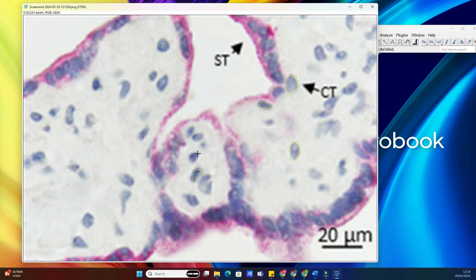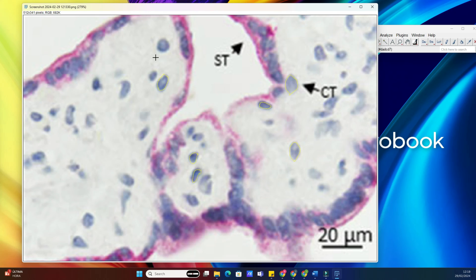Now here's where the magic happens. Hold down the Shift key on your keyboard and draw another polygon around the next cell. Notice how each polygon we draw is added to our selection. We can continue this process for as many nuclei as we need. And there you have it — we've successfully selected multiple regions of interest in just a few clicks.